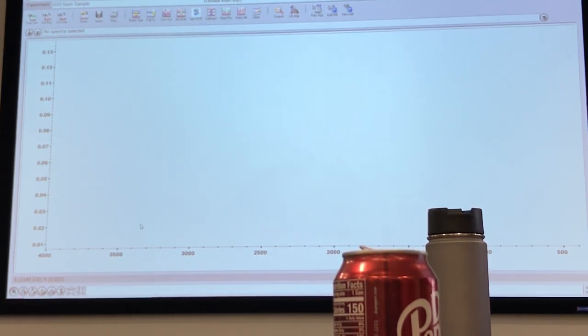Again, the other part is, if your individual component is really low in concentration, like maybe 3 or 4%, like the dyes or the phthalates and stuff like that, it gets very tricky, because if the spectral features are not very clear, it cannot even separate it out. So in those cases, you definitely want to check it by subtracting on your own, because you have more flexibility, more power to do that when you do it on your own.